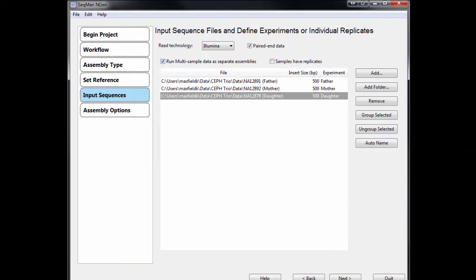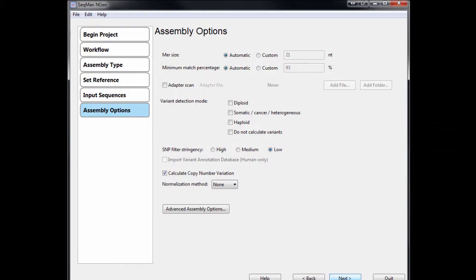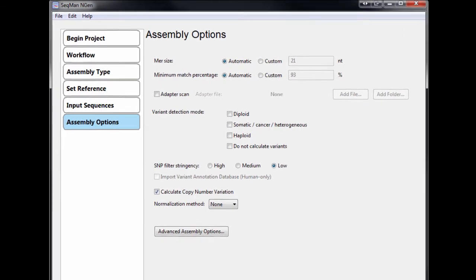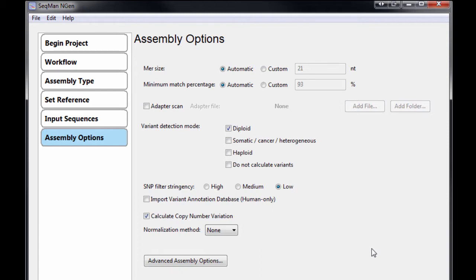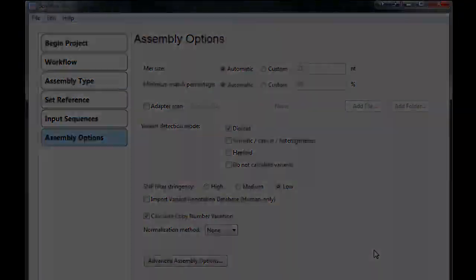Beyond assembling and mapping read data, the software automatically includes tasks like variant detection, CNV calculation, RNA-seq normalization, and ChIP-seq peak detection as part of the assembly process for streamlined and intuitive project setup.